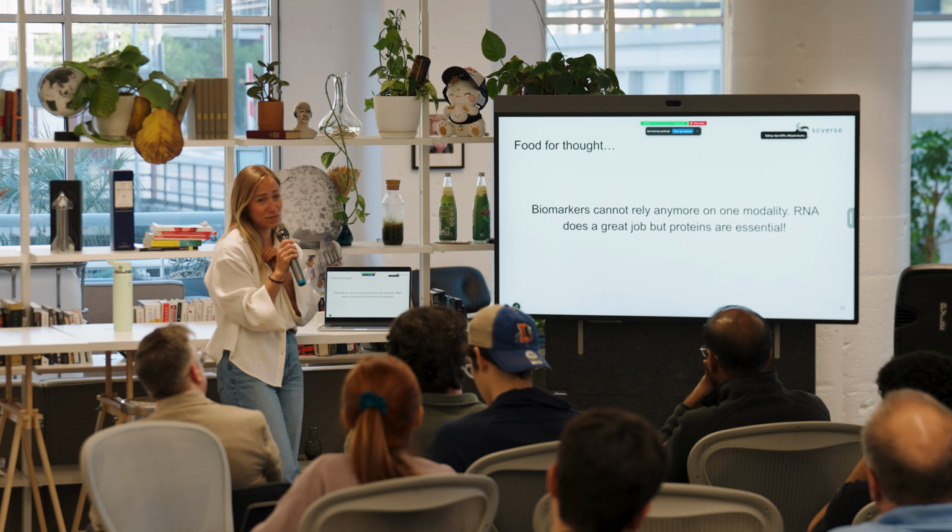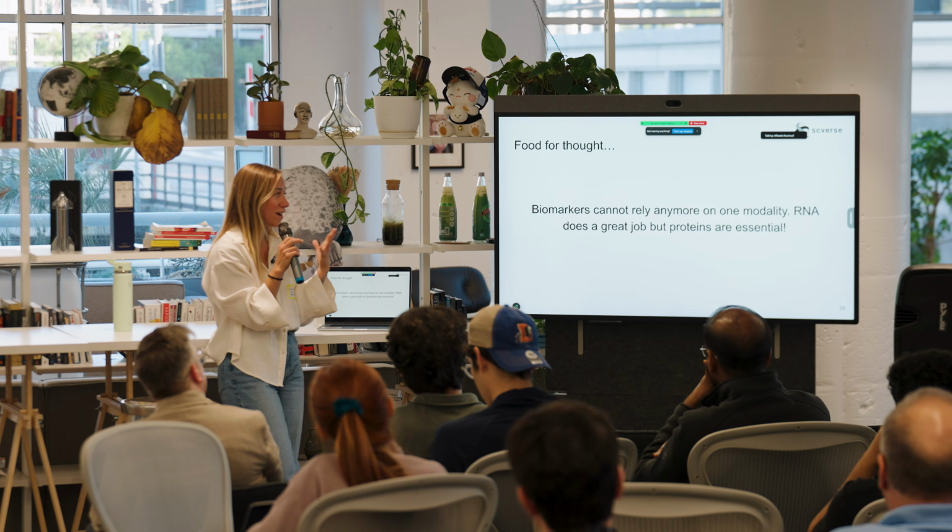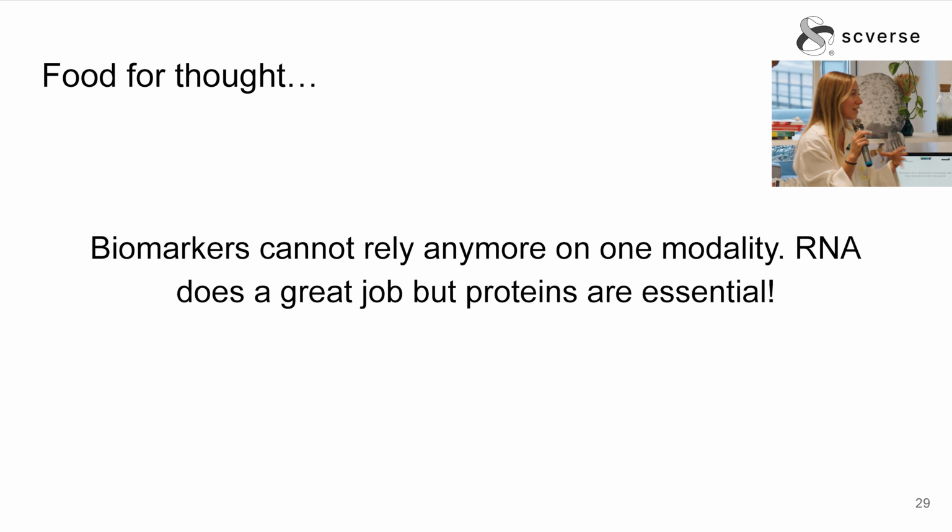And I have a last message, because this event is about single cells and our history is single cell RNA-seq. But this is food for thought. We've been expanding, as I said before. We're doing all things single cell, not just single cell resolution. Modalities are important. And lately, my obsession, as you probably noticed from the papers we published last year, is proteins, because 70% of the drugs are actually predicted and validated on proteins, not on RNA. RNA is great, but maybe not enough. Think beyond. That's food for thought.